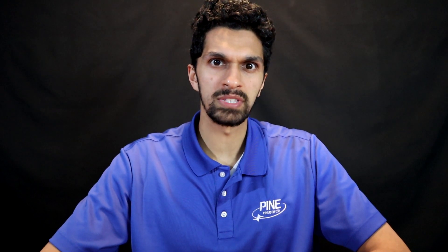So now that we understand the equation, let's take a look at some rotating disk electrode data. So I have my rotating disk electrode data. This is the rotation rate, and this is the limiting current. Rotation rate is in rpm, and limiting current is in microamps.